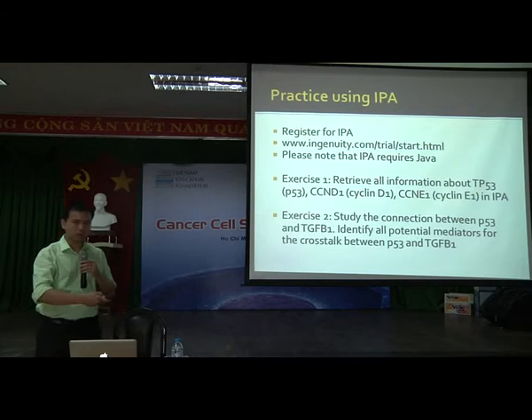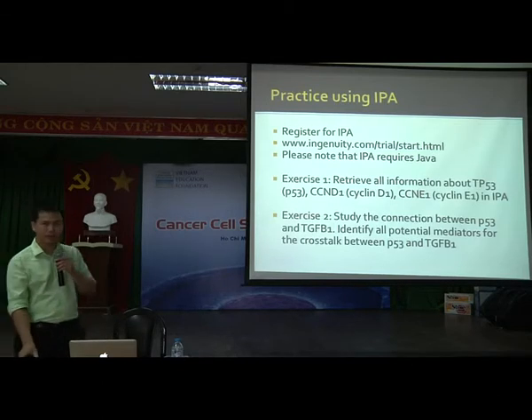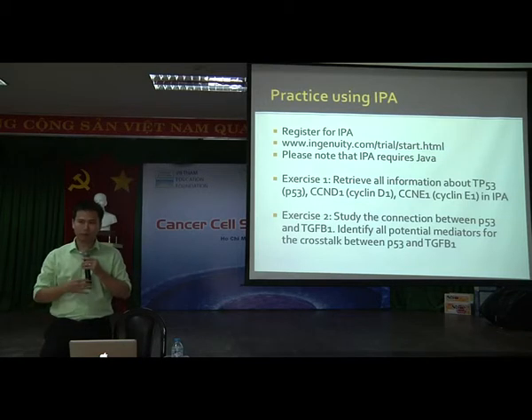Okay, so for those who have not logged into IPA, please do it right now. And for those who have already got access, please turn on your IPA, and we're going to practice right now.